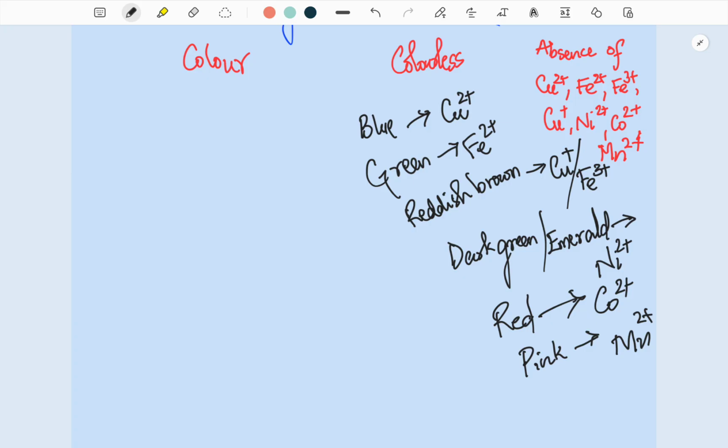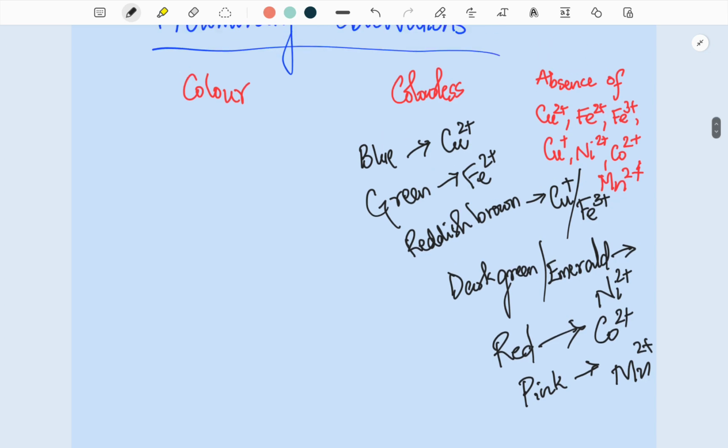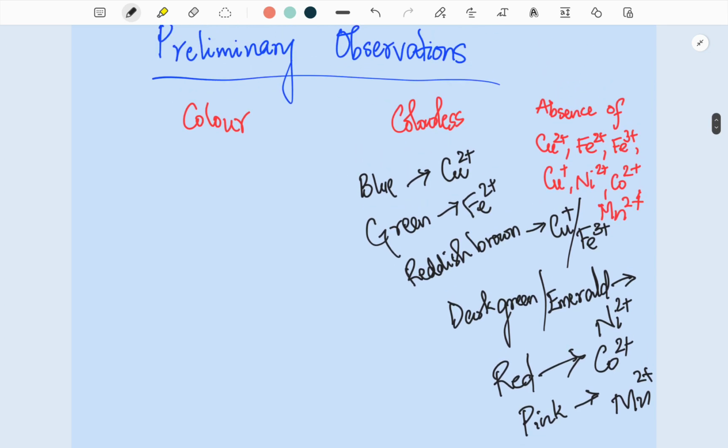Now I am going to tell you what you need to do when you are writing this in the record book or in your exam. Now I have just written color, colorless, absence. That is just what I wrote while explaining.